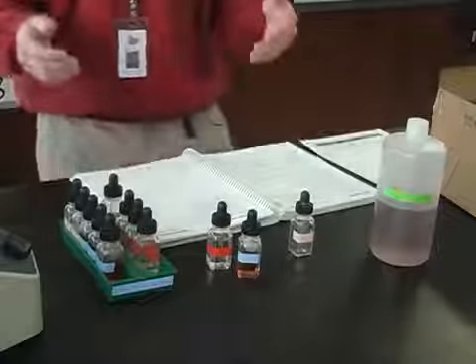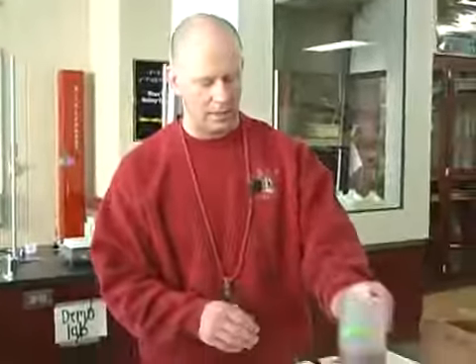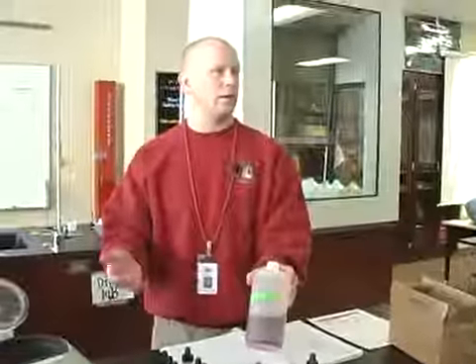So then when you walk in on Tuesday or when you walk in next week to start the lab, you're prepared to come back and start with the 10-ion solution, the solution that has all the qualitative analysis ions in it. And you can start from step 1, take good notes as you go along, and separate the ions. So then when later in the week it's time to start with your unknown solution, you've got a good reference to look back on.